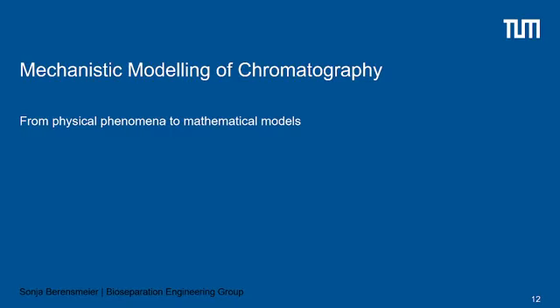Hello everyone, welcome back to the second part of this lecture on mechanistic modeling. In the second part we're going to especially focus on mechanistic modeling of chromatography. We're going to take a detailed look at the mathematical models that describe chromatography on a basic level. And then we are also going to look at what different models exist and how these models are used.